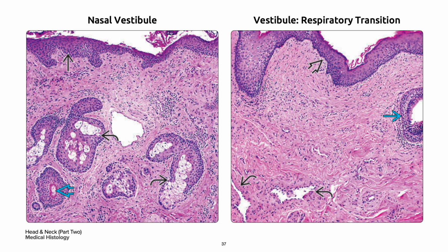On your right is the transition from vestibule to respiratory mucosa, which is gradual, with thinning of the epidermis pointed out in the bold black arrow, loss of your pilosebaceous units, and increased venous vasculature in a curved black arrow, with occasional salivary glands and ducts in a single blue arrow.